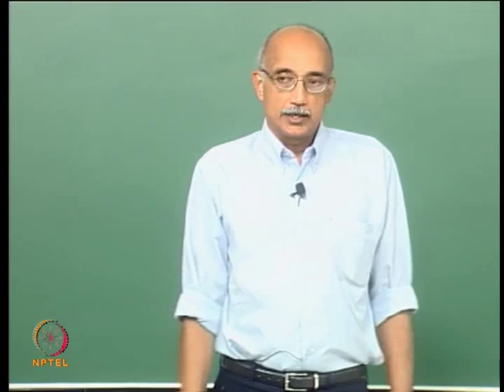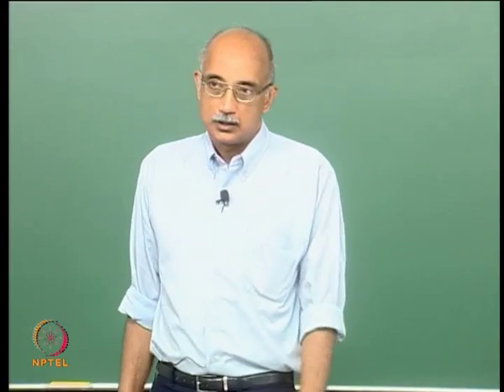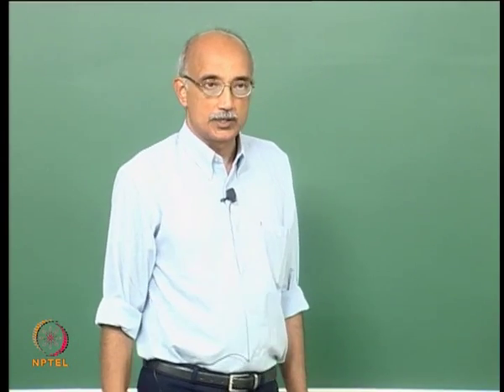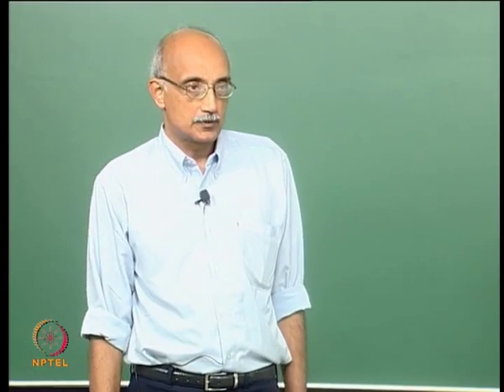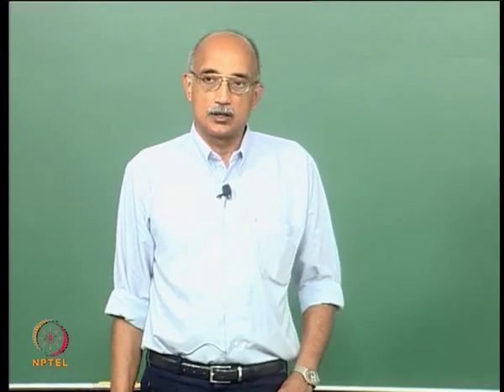Welcome to this 8th lecture in the particle characterization course. In the last lecture, we started discussing some static methods for characterizing particle size. We initially discussed various microscopic techniques for doing size analysis, and later we started discussing methods based on light scattering.